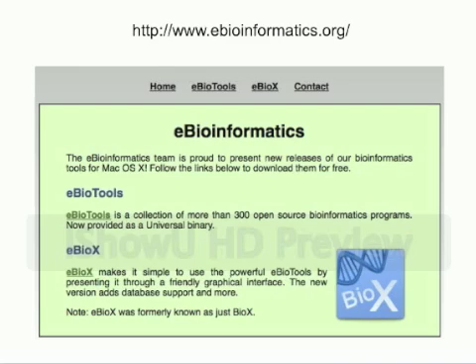That's essential for bioinformatics. So you can do BLAST, you can find out what your protein's PI is, and so on. You can do multiple sequence alignments and everything. And eBiotools also has a graphical user interface called eBioX. So when you install eBiotools, or when you get Neil to install eBiotools, let him also install eBioX. It should automatically install it, but you should check it's been installed.